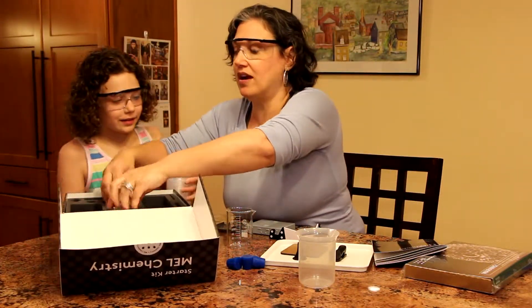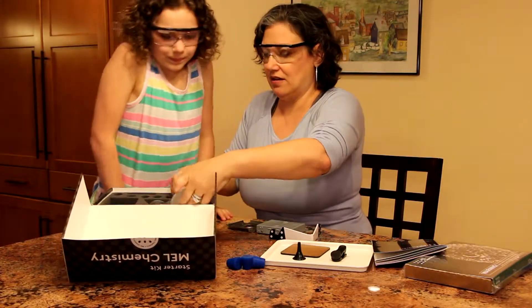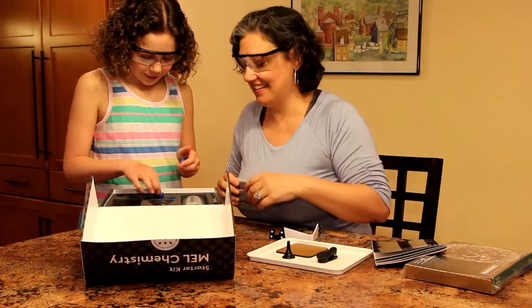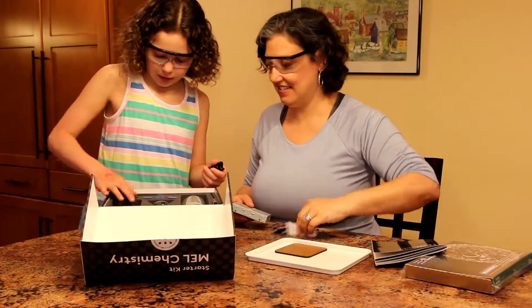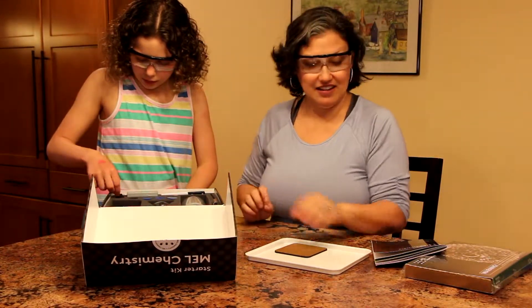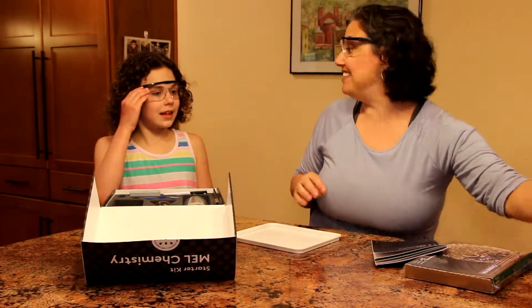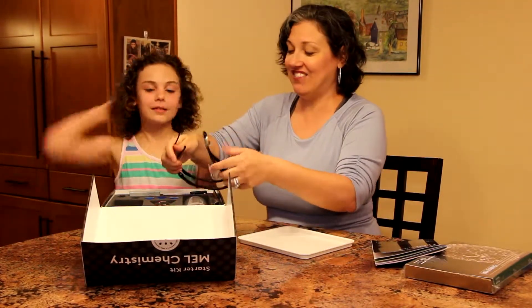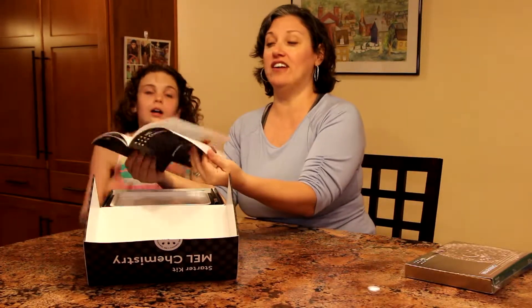Okay, let's put this back in. We're not going to do the first experiment today — we're just going to open all the materials. The cups and the beaker go back. We have the glasses — good job — bye-bye glasses. Well, we'll have them and keep them safe so that when we do our experiment they'll be there. And there's the tray and our instruction booklet again on safety. Do not lose it.